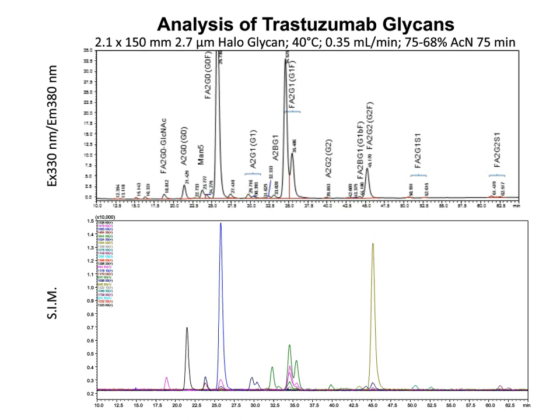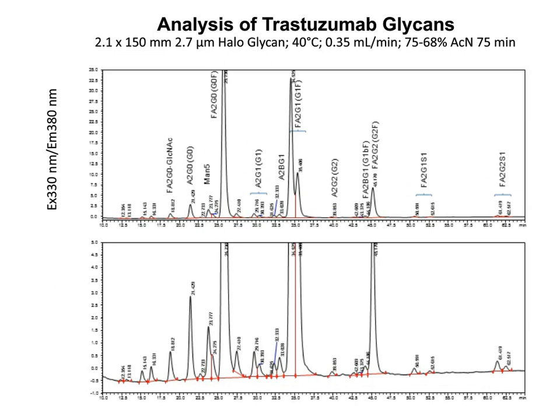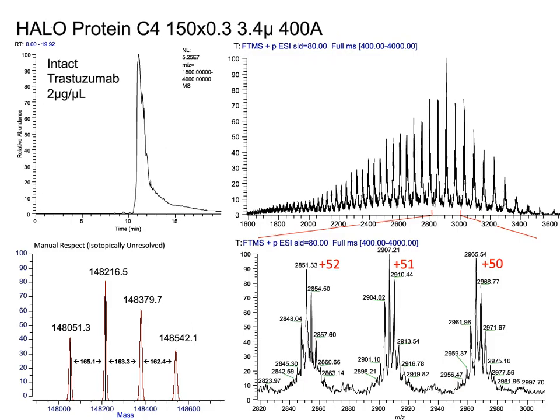So we must recall that all of these additional glycan species are contributing their mass differences to that high-resolution mass spectroscopic data. So the task of looking at an intact monoclonal antibody is not simply deconvoluting, but there is a limitation implied by not only the glycan heterogeneity, but considerable potential polypeptide heterogeneity at each of those glycan variants.